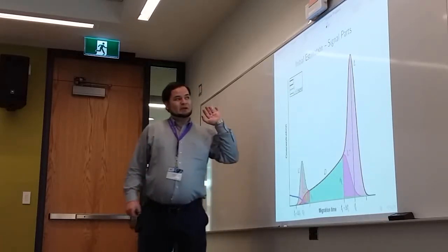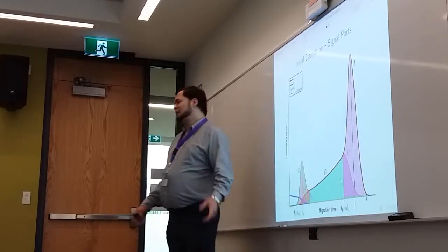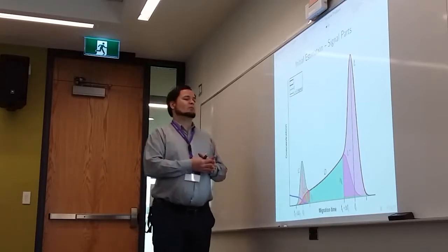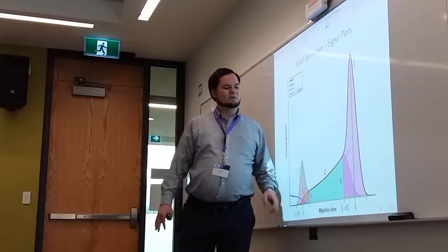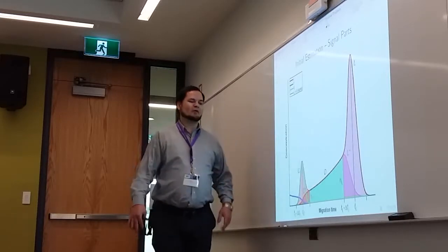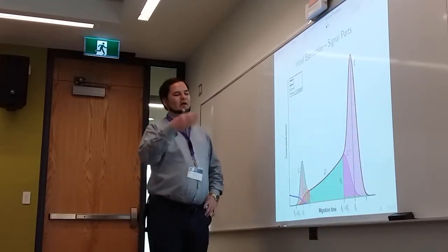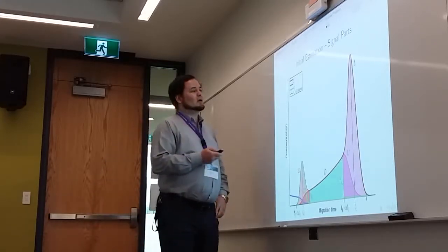All right, so the initial estimation of the parameters. For that, there have actually been previous papers by our lab. There is an existing method called the area method, which breaks the signal up into different areas, and there are some nice formulas, and you can get estimates for K on, K off. So that's the area method.